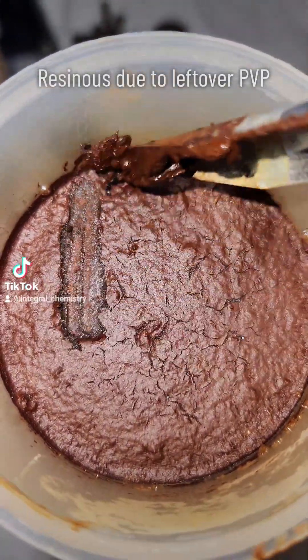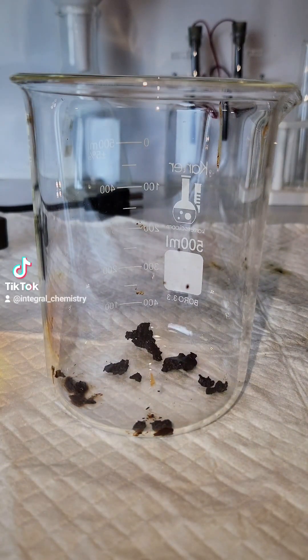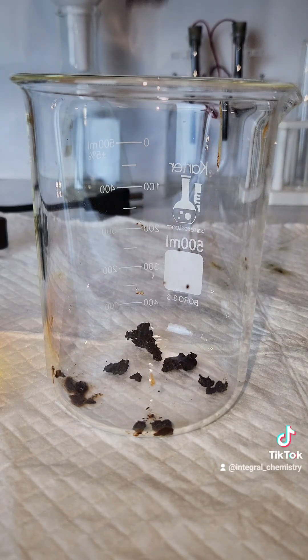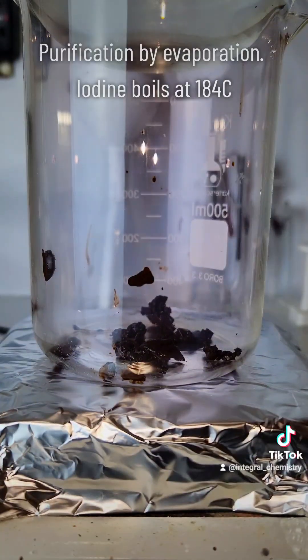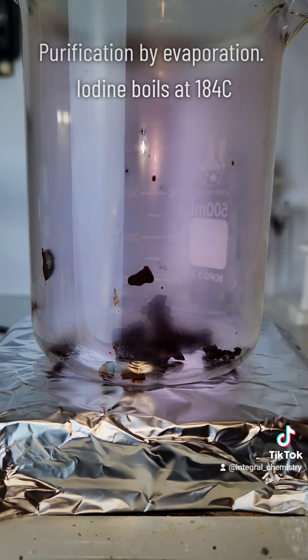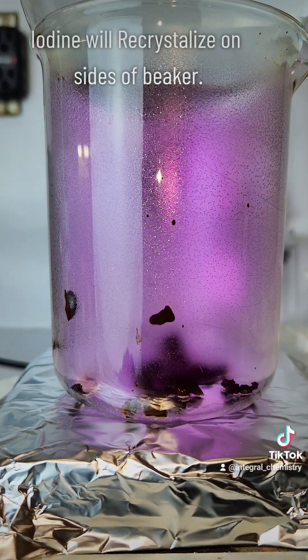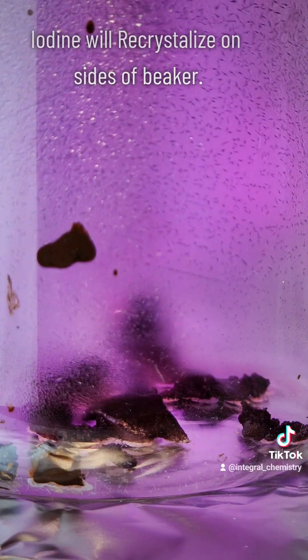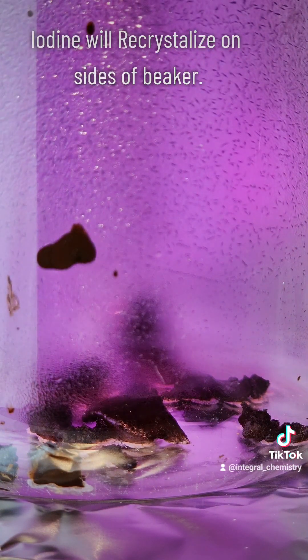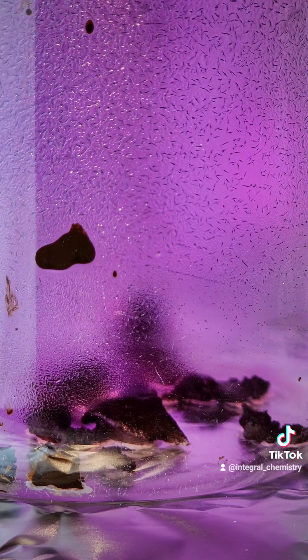To purify my highly impure iodine, I need to scrape it out of my filter and get it into a beaker. My iodine in the filter was pretty resinous, and that's because of some povidone left over, which I'm going to purify away now using evaporation. Elemental iodine boils at 184 degrees Celsius, and by heating it to that temperature, I can evaporate it and it will recrystallize on the sides of my beaker. This step does need to be done under a fume hood because iodine gas, while beautiful, is fairly toxic.